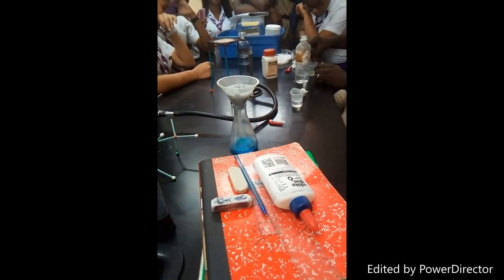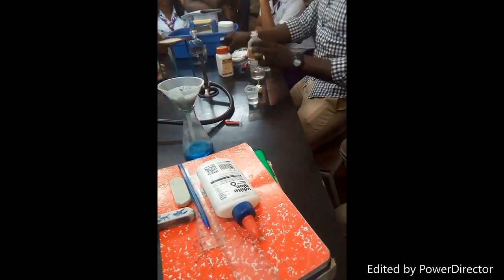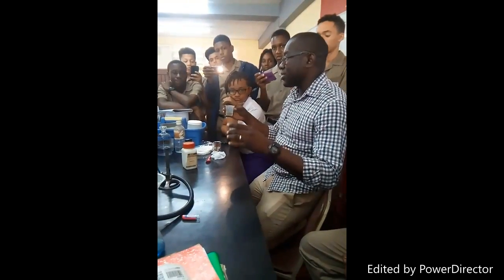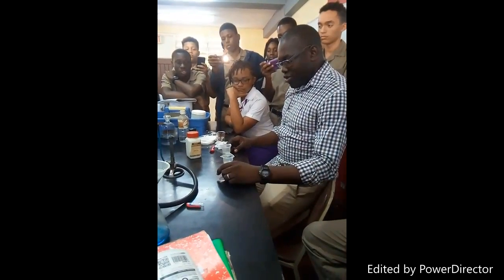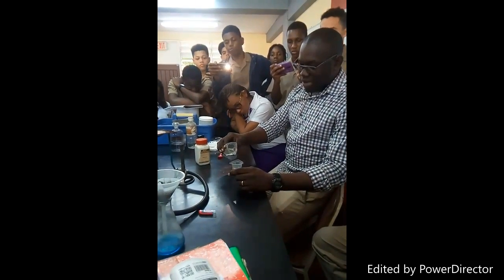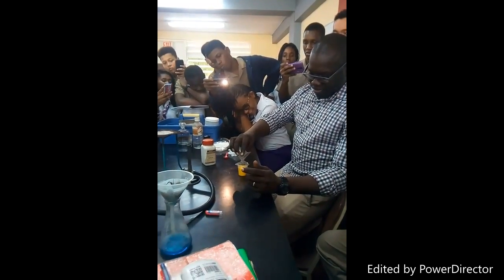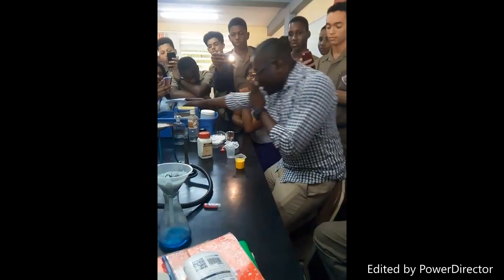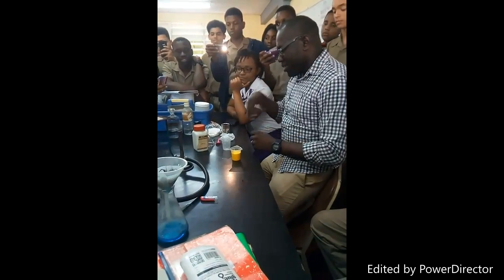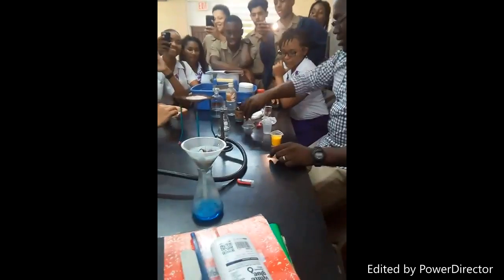Hopefully this is not yellow. It's slightly yellow, that's not nice. Okay, so I have my two soluble salts. Are these liquids? Yes. So now I'm going to pour this onto that. So what I'm basically doing is mixing my salts. Then I get that substance over there. Rinse this a little for me, please.